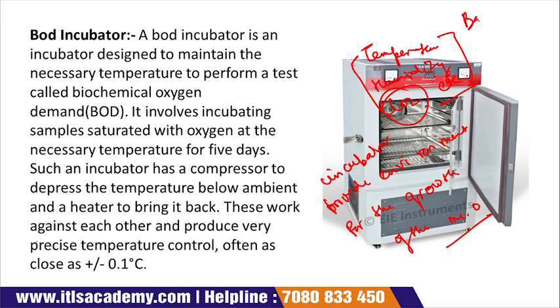The bacteria grow at 37 degrees Celsius especially. So we have to give 37 degrees Celsius with the help of the incubator. After that the bacteria will grow. So this is all about the instruments which we are using in our lab.